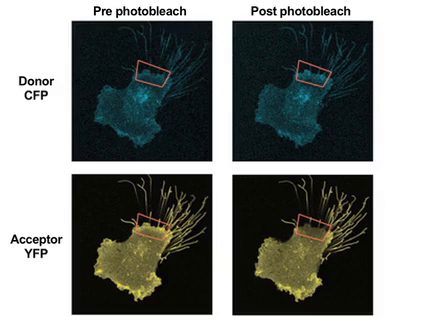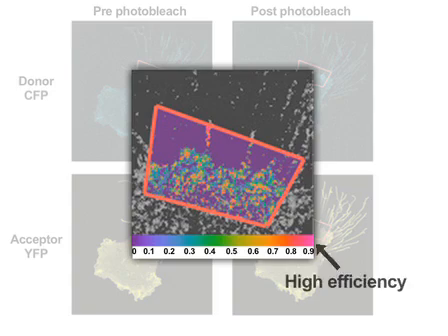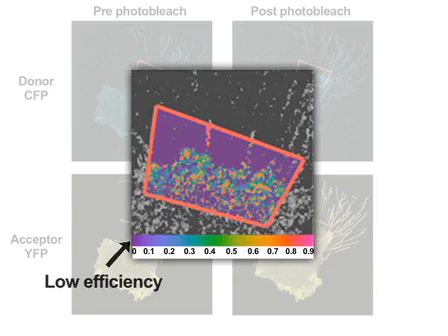These representative images show an acceptor photo-bleaching analysis of FRET occurring between CFP and YFP in an EAHY926 cell. The CFP and YFP emission channels were monitored separately before and after photo-bleaching. Photo-bleaching and calculations were restricted to the region within the red box. FRET efficiency is displayed as an absolute range from high, coloured red at 1.0 to low, coloured purple at 0, on a magnified overlay of a CFP-YFP merged image for orientation purposes only.